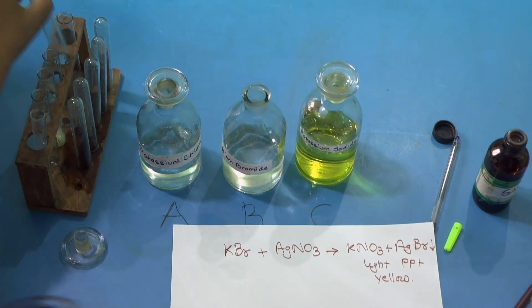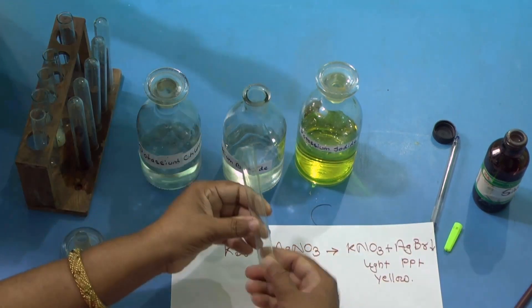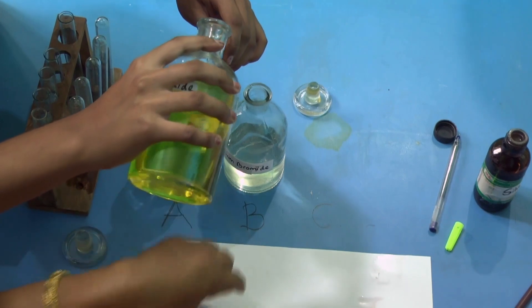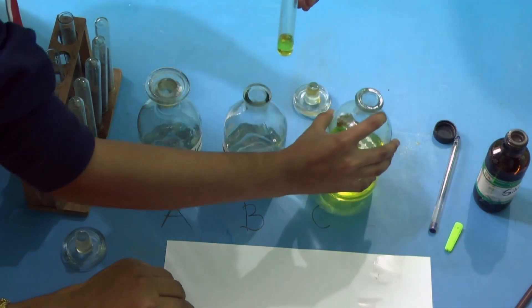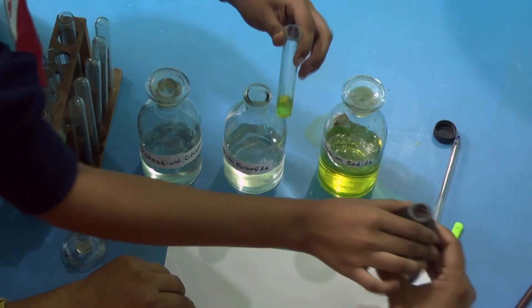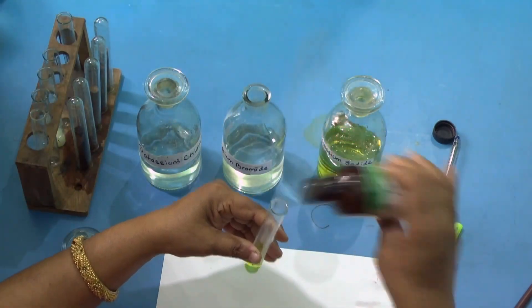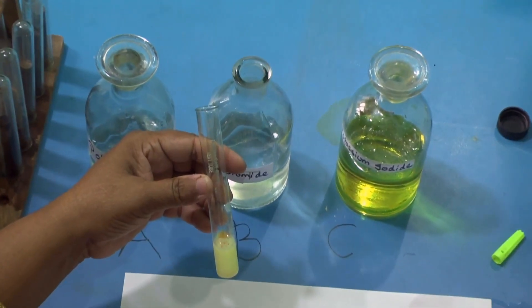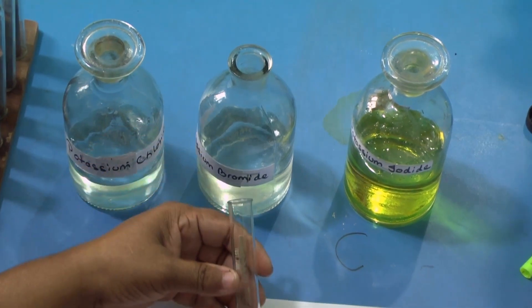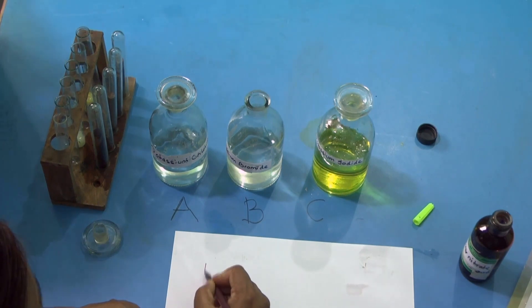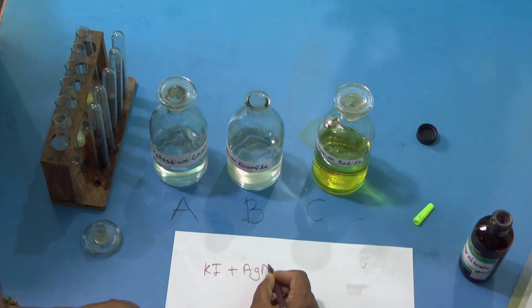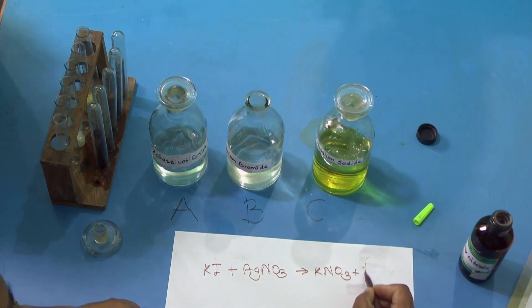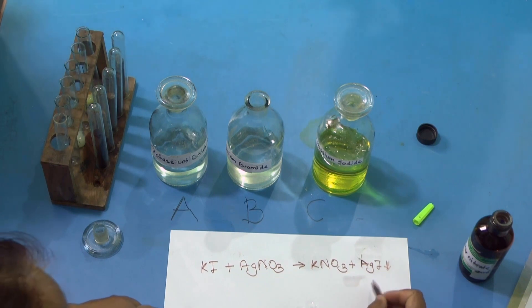Now in the third test tube, test tube C, we will take potassium iodide solution and pour silver nitrate. Children, you can see a bright yellow PPT. With potassium iodide, when I added AgNO3, we got KNO3 plus AgI, which is a bright yellow PPT.